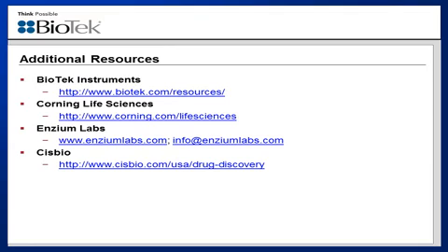So with this type of analysis, in my opinion, the ability to actually see the true inside of the tumoroid structure is probably not going to be as critical as with other types of cell analysis that incorporate different 3D structures.